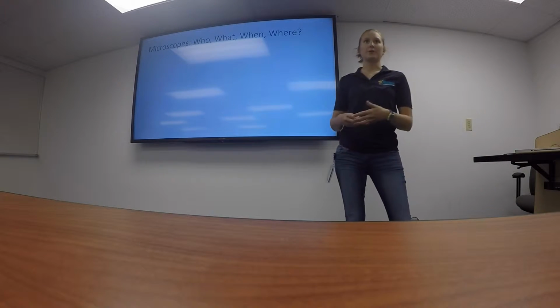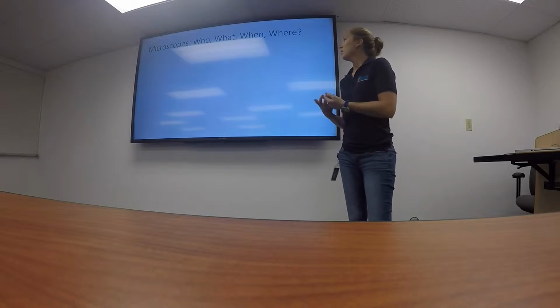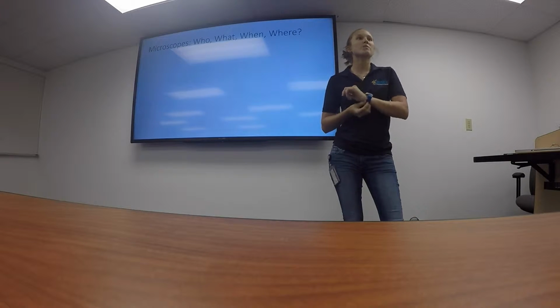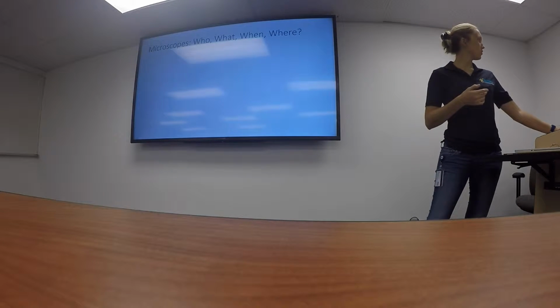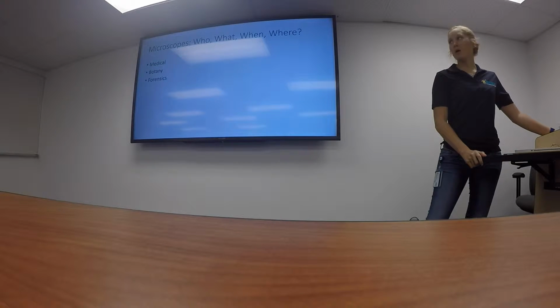So has anyone ever used a microscope here before? A few of you may have, a few of you may not, and that's okay. I didn't learn how to use a microscope until I went to college. So a few hands, very good. With that being said, where have you used a microscope? Where can you think of a microscope would be used for? So our top choices usually are medical research, we have plant biology or botany, we have forensics, which is very popular, genetics is another one that falls under biology, chemistry as well, it's not listed, and also educational purposes.